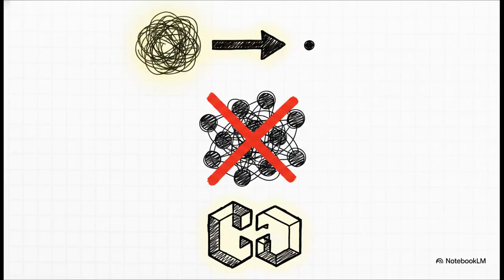Let's take a step back and look at the industrial reality of this technique. What's the main takeaway? Well, size exclusion chromatography is basically a superpower. It's exceptionally good at separating compounds with vastly different masses. That makes it absolutely indispensable for quality control of commercial polymers or isolating natural macromolecules.